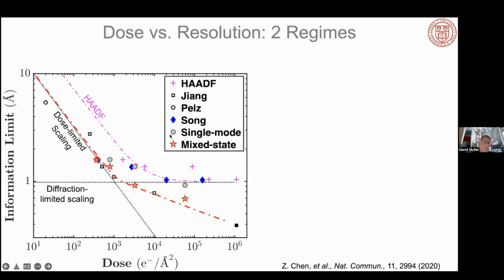I just want to point out that ptychography, because it uses every electron in the material, on the detector, and everything that was scattered through the material, is actually a very, very dose efficient imaging method. And it's more dose efficient than all the other imaging methods in the microscope we can think of to date.